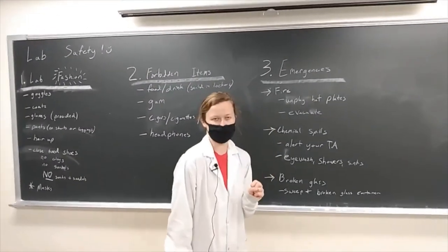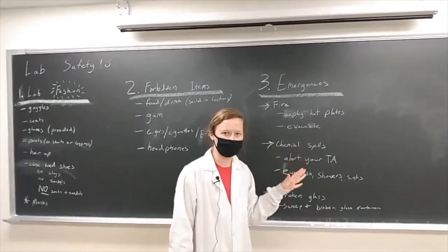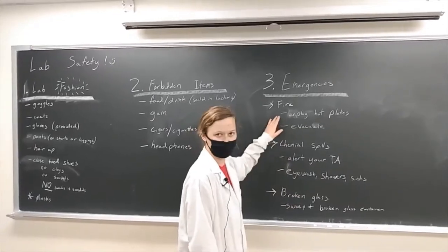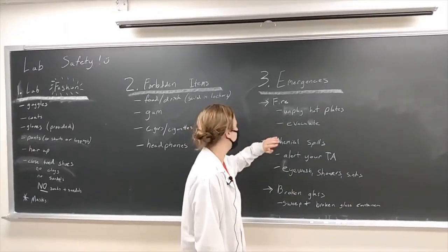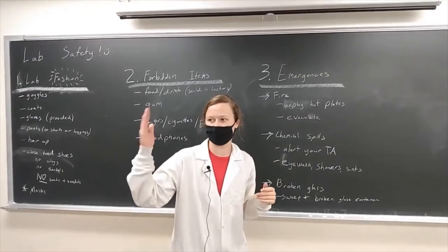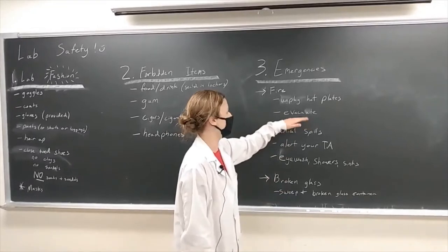Finally, let's talk a little bit about emergency protocols. In the case of a small fire, you can flag your TA, ask them to come over and they might be able to put it out pretty quickly. If you're not sure, or if it's a large fire, immediately turn off all the hot plates. Just walk around and unplug them so your TA can see from the doorway that all the hot plates are turned off, and then immediately evacuate the building.